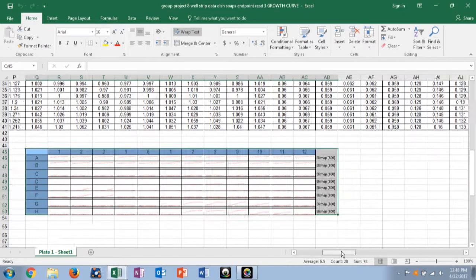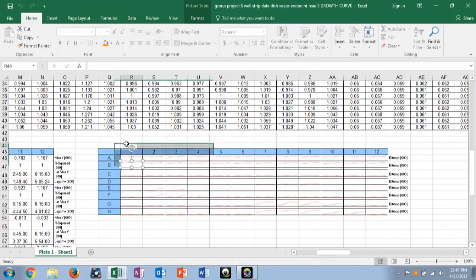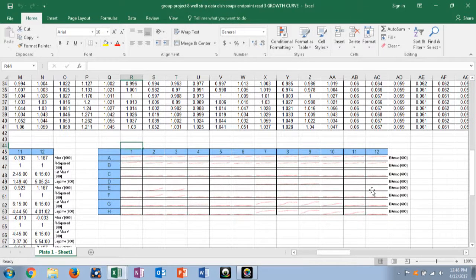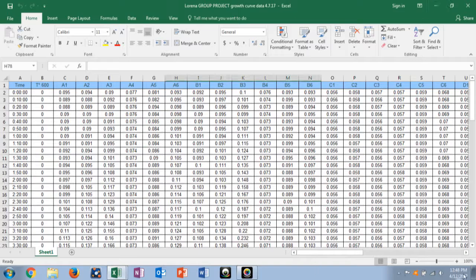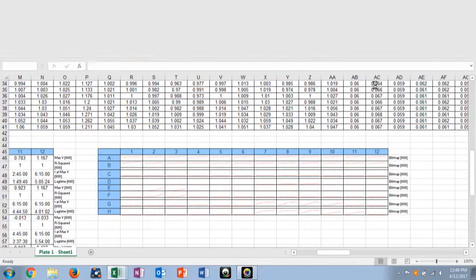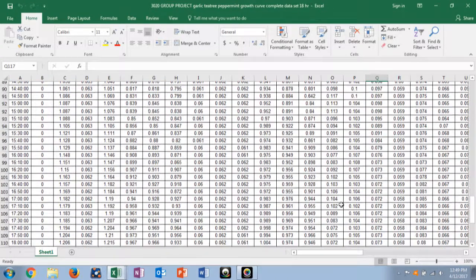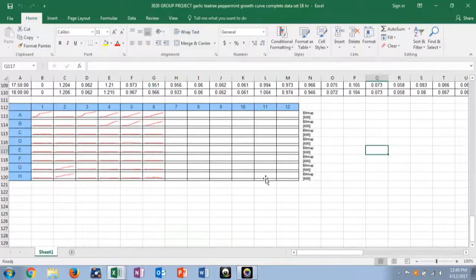They look like this. This one's not the greatest example, but you can see the lines here. And this lets you see what grew and what didn't, just as a general overview. And I believe you can paste this into Word. Let's grab a different group. Maybe this one from my 30/20 class. Do they have it? Yes. So this one's a little bit more clear.